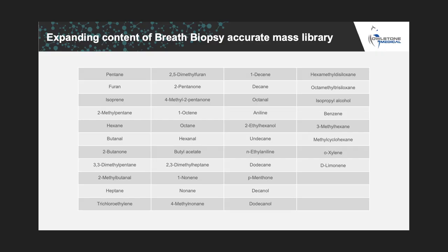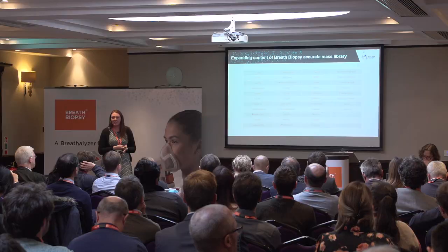I'm just going to flash this up here for a few seconds, just to show some of the compounds that we've already started adding to this library over the past few months. There are some compounds of interest that have been mentioned this morning, such as the aldehydes and limonene. Hoping this will be available afterwards if people want to delve in more depth.